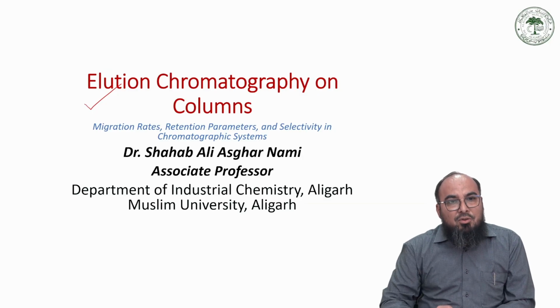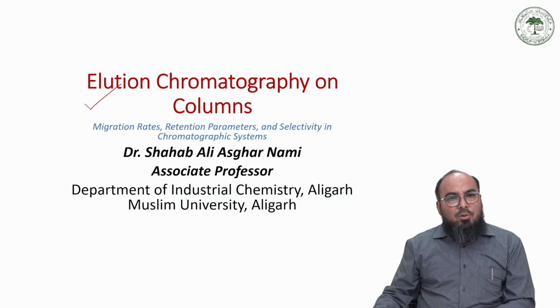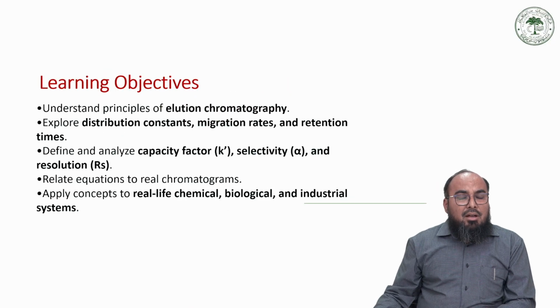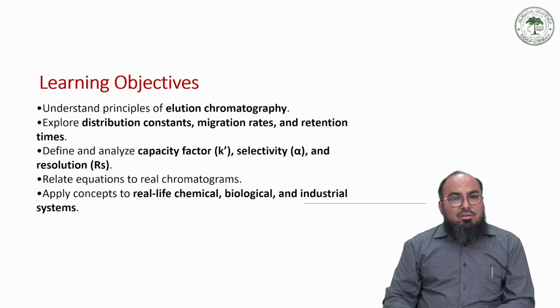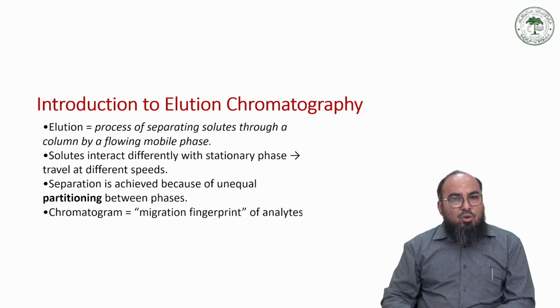So today we are going to explore the basic concepts involving elution chromatography, the migration rates, the retention parameters, and also the selectivity of different chromatographic columns with regard to the mobile phase, and somewhat about the detectors. These are our learning objectives. So now quickly move towards elution chromatography.